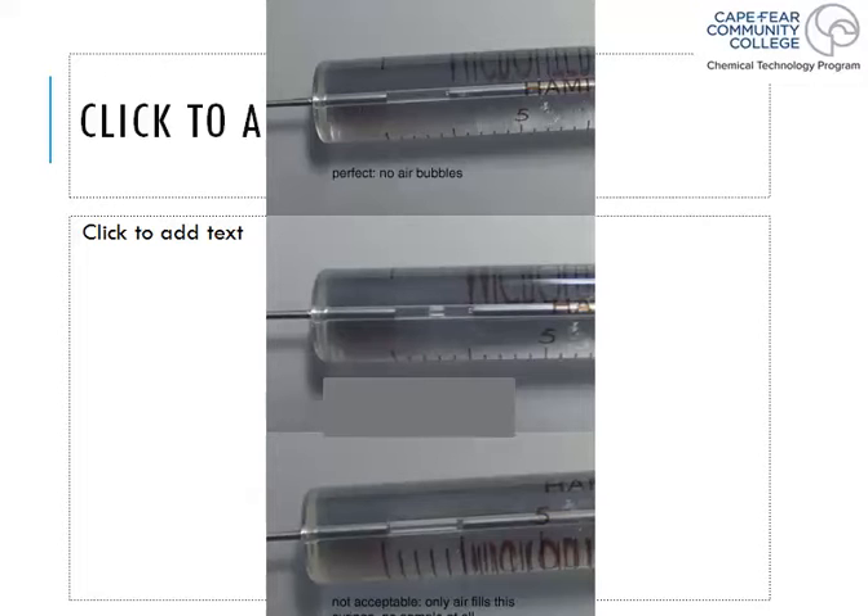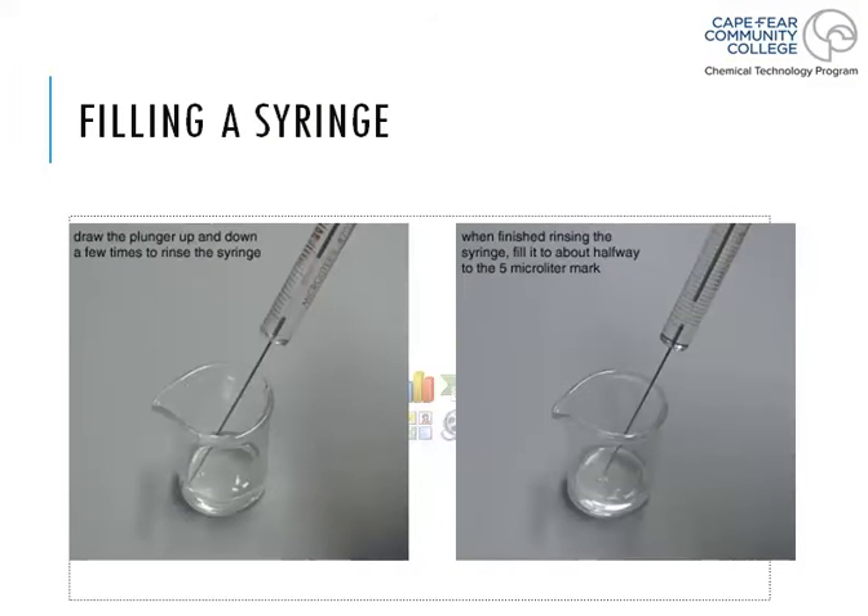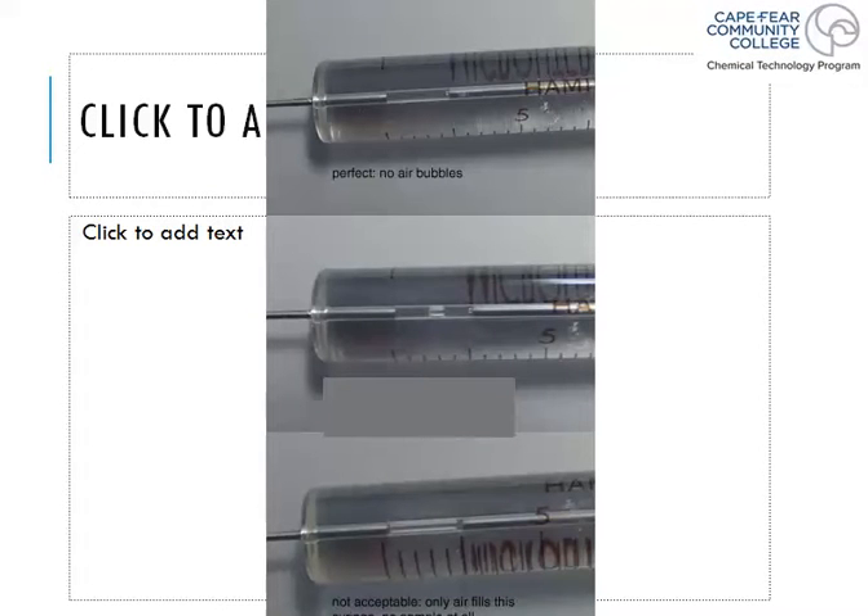At the very bottom of the syringe barrel it's really all air — no sample — and you can clearly see the difference between the sample compartment and the air compartment. Working with tiny volumes makes this hard to see, but my best practice is to flush the syringe a couple of times, pull back way more than needed, then slowly push the plunger up to the required volume. Any air bubbles will be pushed out and you'll be ready for your injection.